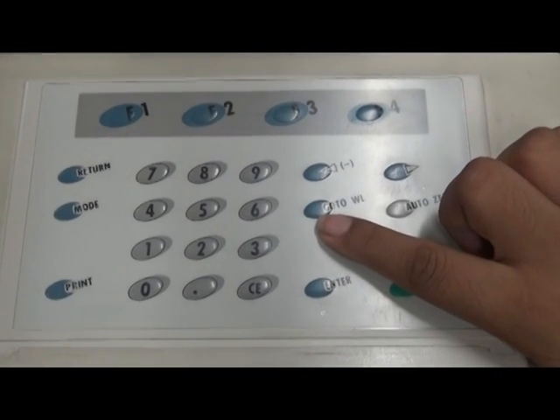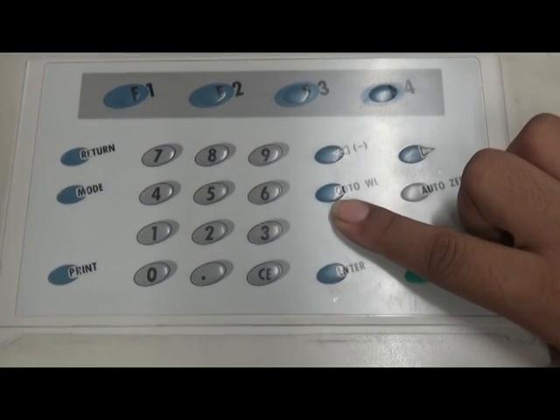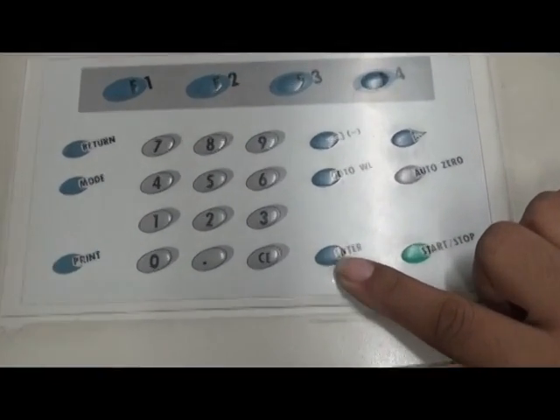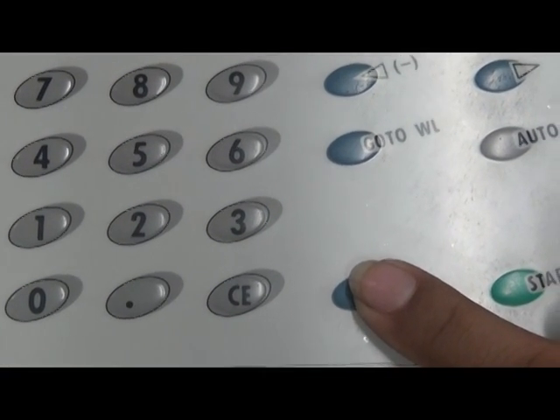This is called the go to WL key. This is the key that is used to change the current wavelength. This is called the enter key. When you enter a value, press this key after the value to set the entered value.